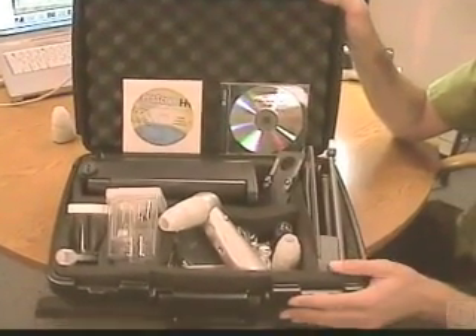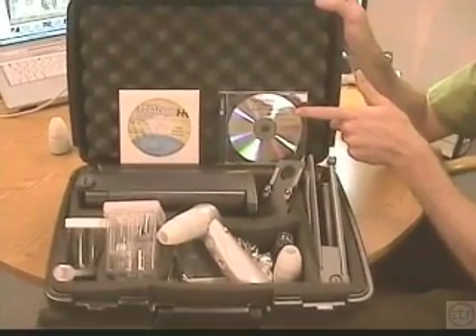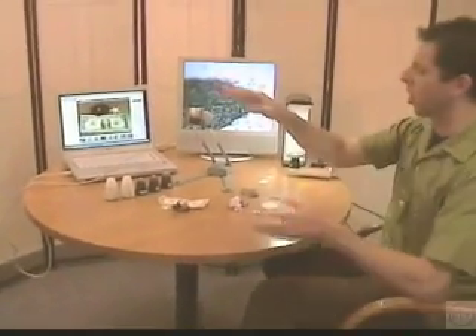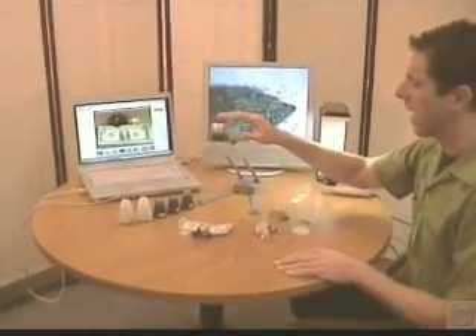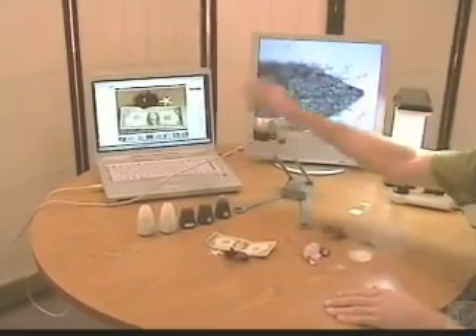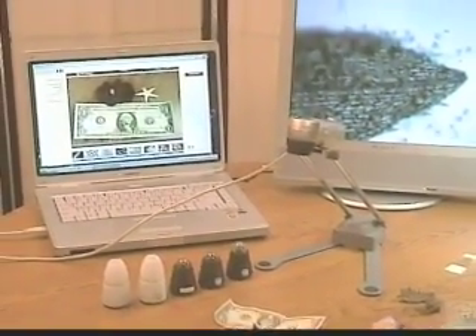This is a ProScope kit with the camera, lenses, accessories, and our curriculum for education that we wrote for the cameras. The ProScope HR is the digital version that connects directly to the USB port on a computer. I have it going to my laptop, and I have it set up in one of the three modes we're going to look at today.